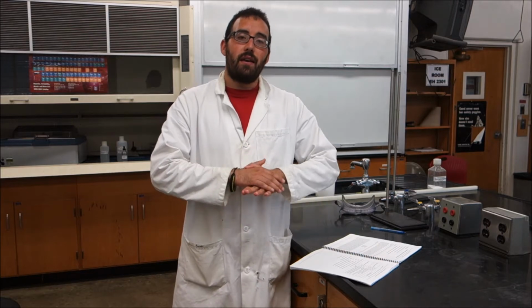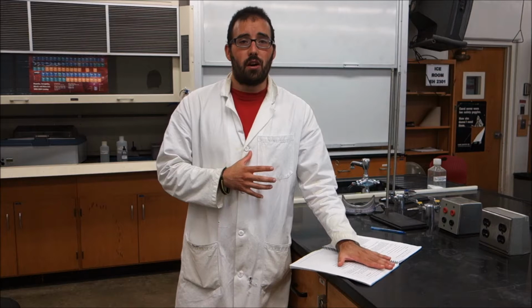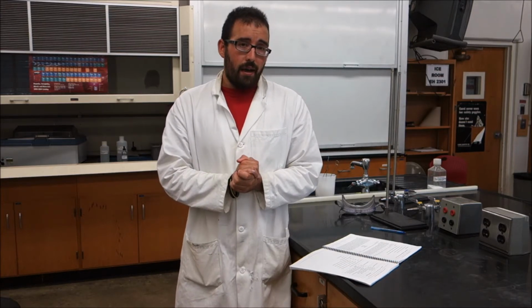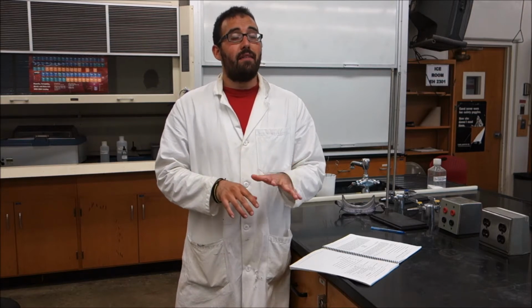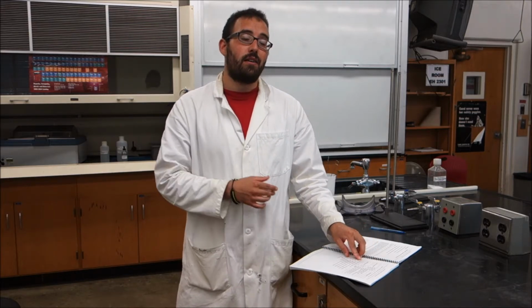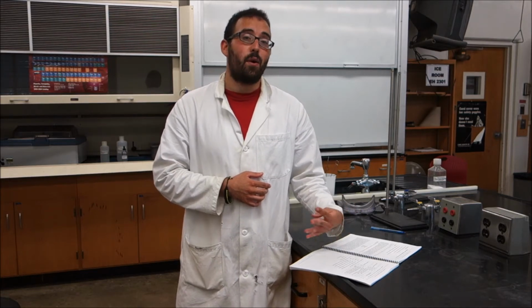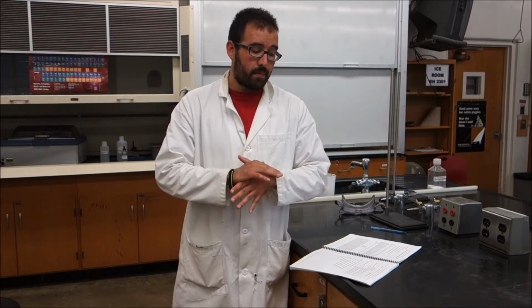What we're going to go over is the basic solubility rules and how to use the chart to figure out if things are going to be soluble or insoluble. Now, what's going to happen in this experiment is you're going to get a set of 5 solutions, so you'll get 5 vials, and it'll be one of the sets listed in your lab manual. So it'll be either set A, or set B, or set C, or set D. You're not going to have mixing and matching between the sets.